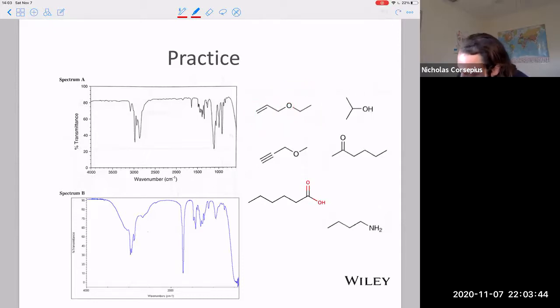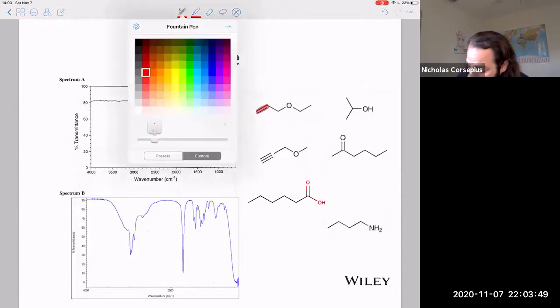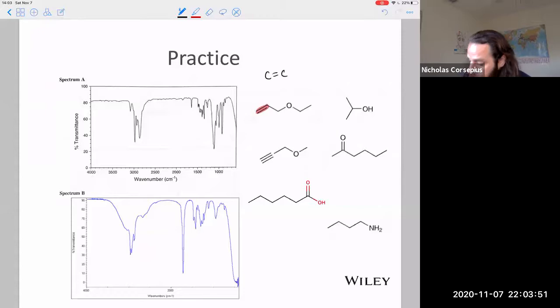Instead, it's going to be either this carbon-carbon double bond, or I also have sp2 hybridized carbon-hydrogen bonds. Okay, so important to remember what we can actually see with IR when we're looking at these molecules. I wanted to bring that up because I think everybody's eyes have a tendency to gravitate towards that oxygen and think, oh, I can spot that. We can't spot carbon-oxygen single bonds.